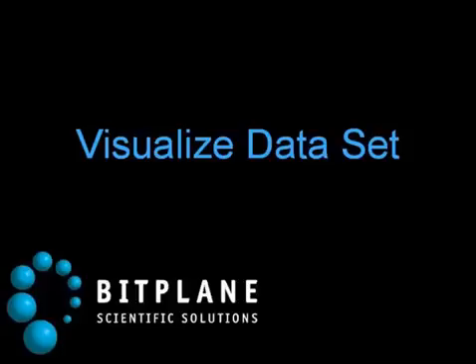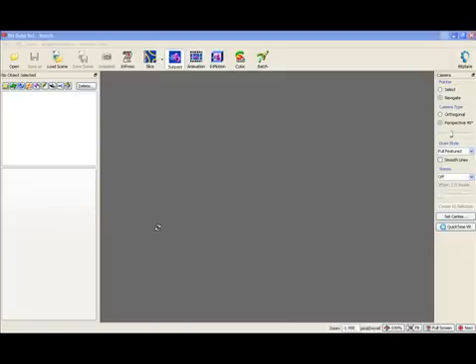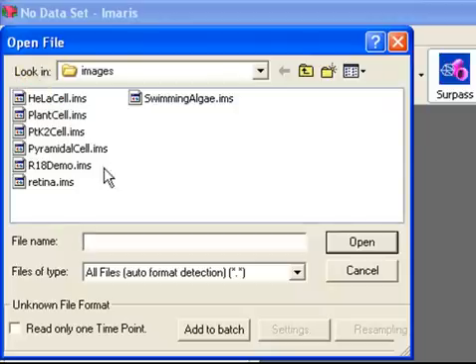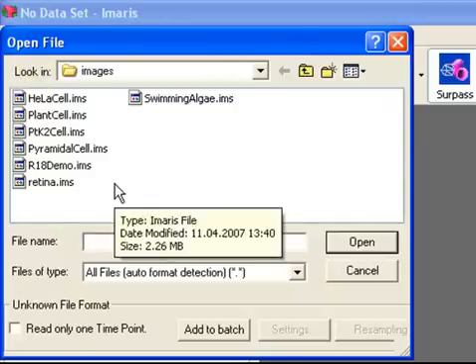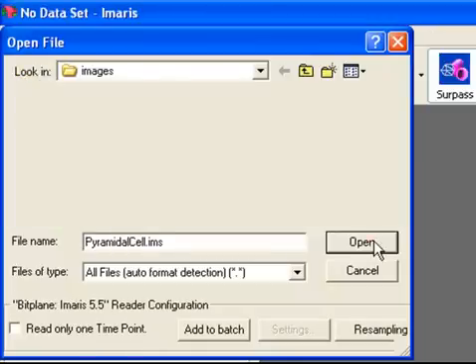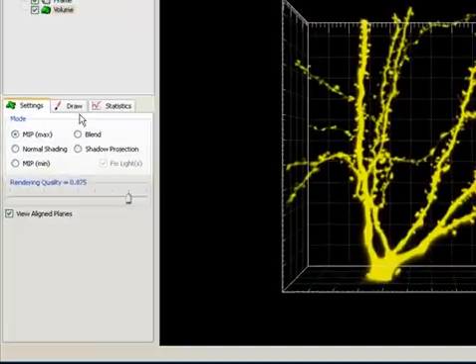In this tutorial you will learn the basic working steps of Imaris. We'll start by opening the dataset Pyramidal Cell. The image is presented as a 3D reconstruction in Maximum Intensity Projection mode.